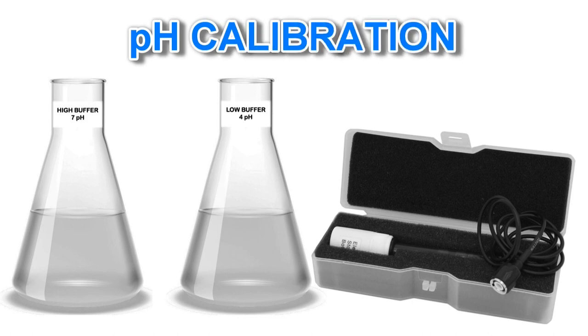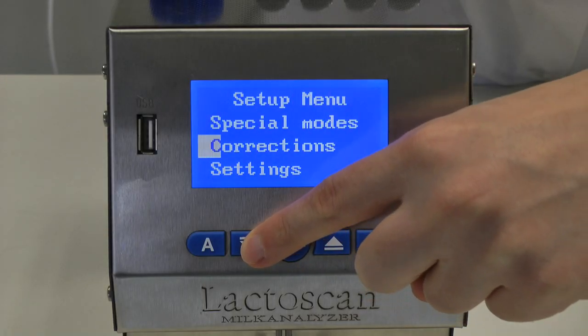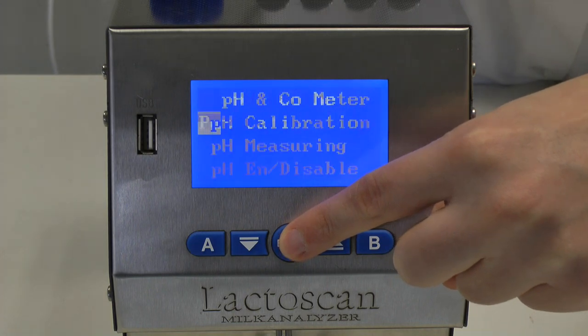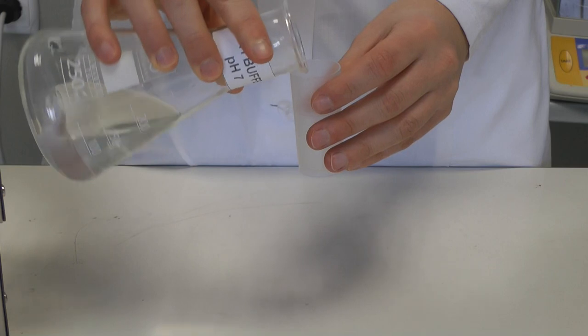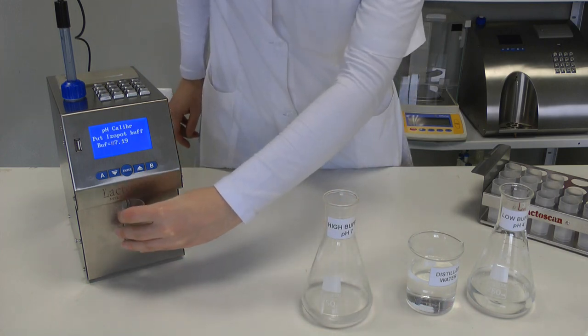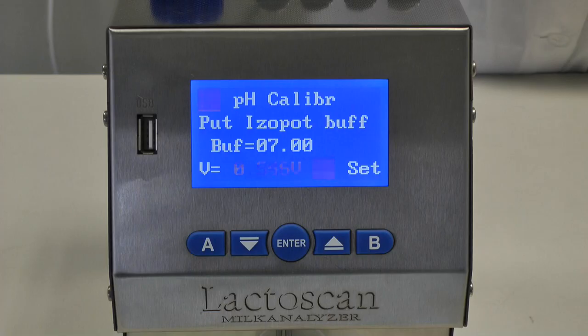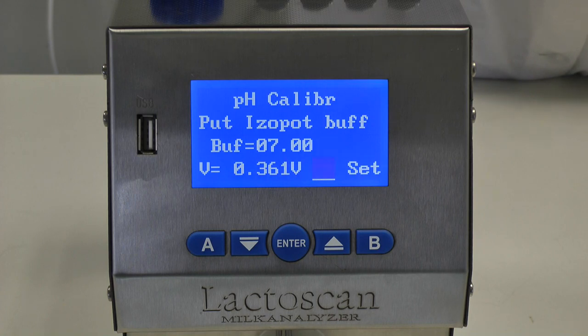pH electrodes need to be calibrated on a regular basis. Calibration is an important part of the electrode maintenance. This assures not only that the electrode is behaving properly, but that the system is operating correctly. For this purpose, two sample buffers are used: low buffer, for example 4, and high buffer, for example 7. To do this, switch on the analyzer and hold the button Enter. By using the buttons, go to pH and conductivity and press Enter. Go to pH calibration and press Enter. Using the analyzer's buttons, set the exact buffer value. Put the probe in the high buffer. Press the button Set when the readings stop moving. The analyzer automatically takes out the calibration liquid.